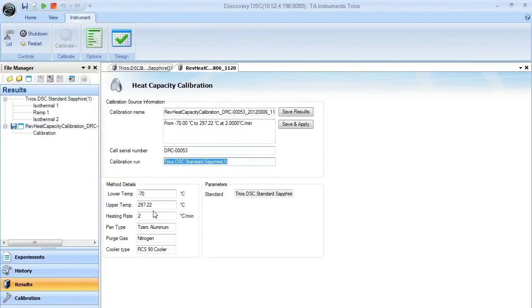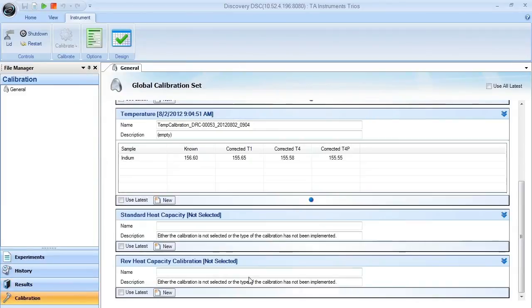If the information here looks correct, we can then say save and apply and the information will be passed over into our reversing heat capacity calibration window and we'll have an item to use.